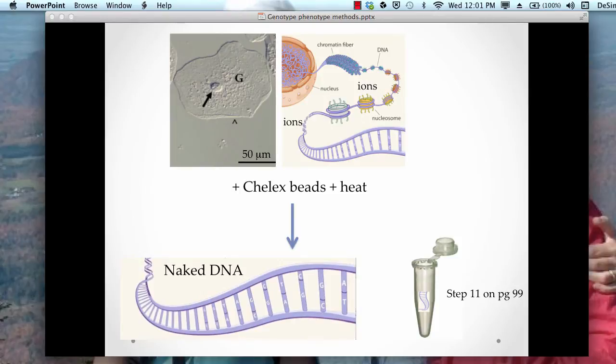The first thing you need for RFLP analysis is a piece of DNA. You will analyze DNA from your Tas2R38 gene that's been made in a test tube using the PCR reaction. You can think of PCR as a molecular Xerox machine for DNA, and you can use it to make many copies of a tiny part of DNA found in a larger collection of DNA sequences. The tiny part you will make will be from the Tas2R38 gene, and the larger collection is your entire genomic DNA sequence that you isolated from your cheek cells.